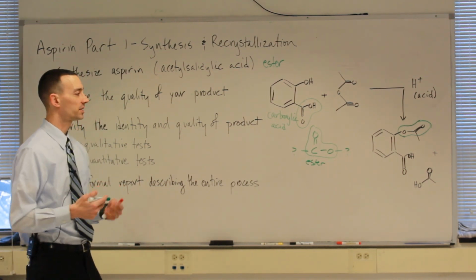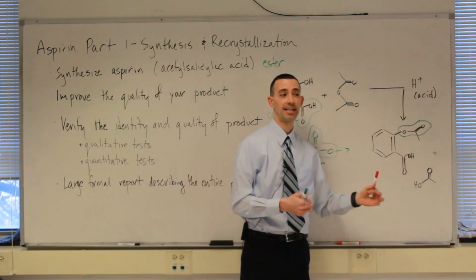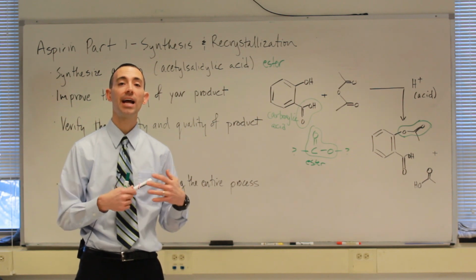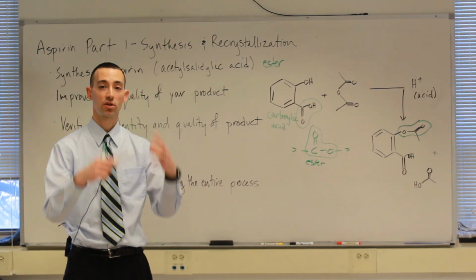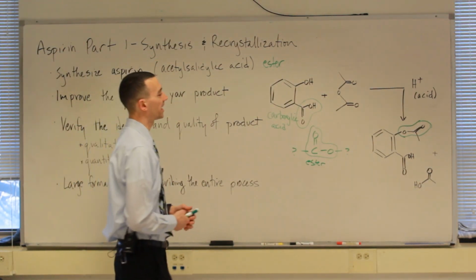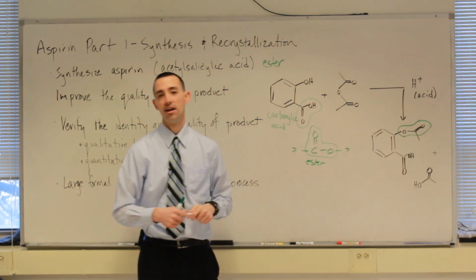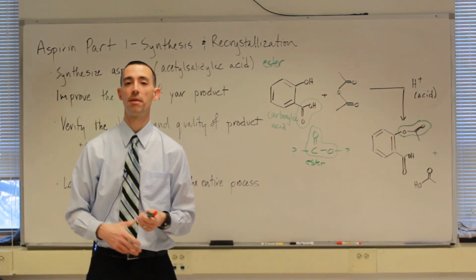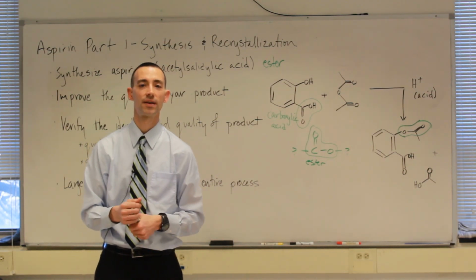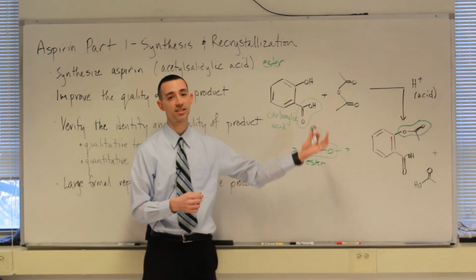Okay? Now when we're done, ideally, if everything went well, we would have our acetyl salicylic acid in our flask, and it would be insoluble in water. So we would add water to the flask, and it would crash out, we say, or crystallize out. However, there's a good chance that not all of our salicylic acid will react during the process today. Maybe we don't let it react long enough. Maybe we haven't heated it up to that temperature high enough to get all of the salicylic acid to react. For a variety of reasons, though, it's often the case that some of your starting material does not react.